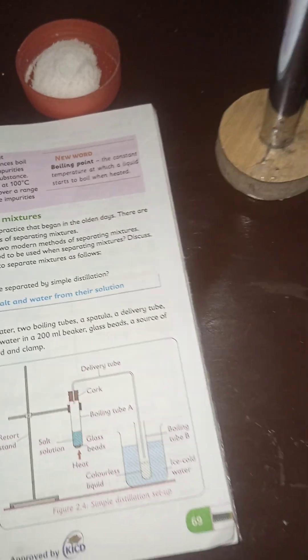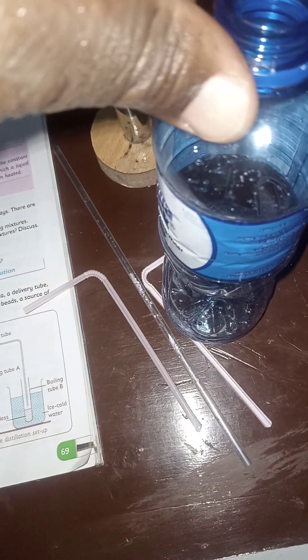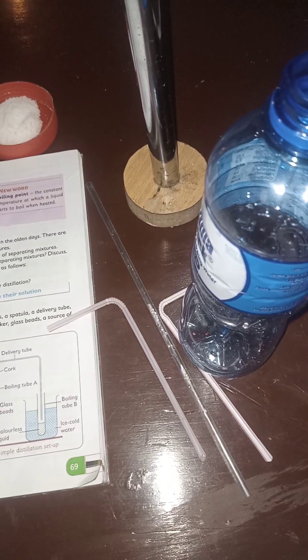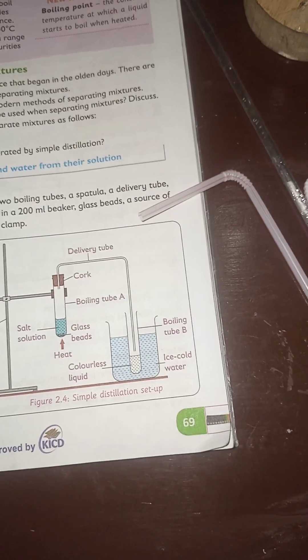Then we are going to use a set of straws as our delivery tube. Then we will use this particular plastic bottle as our boiling tube to collect the distillate from the condensate. Then we are going to use this jar cut from a 10-litre plastic bottle to act as our holder for the ice cold water.